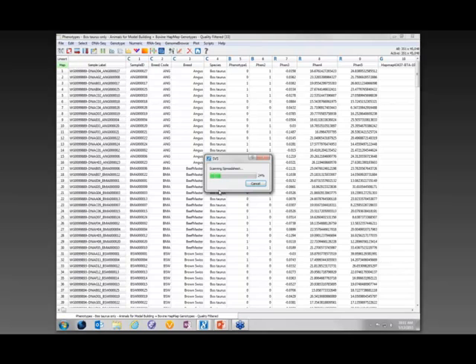You can run GBLUP, BayesB, BayesC, or set up the parameters all at once, and it'll run sequentially. Bayesian methods do take a little bit longer to run, and it is not necessary to include every single marker that is good quality into the set that goes into running them, as it's looking for the loci that have the most effect on the phenotype.